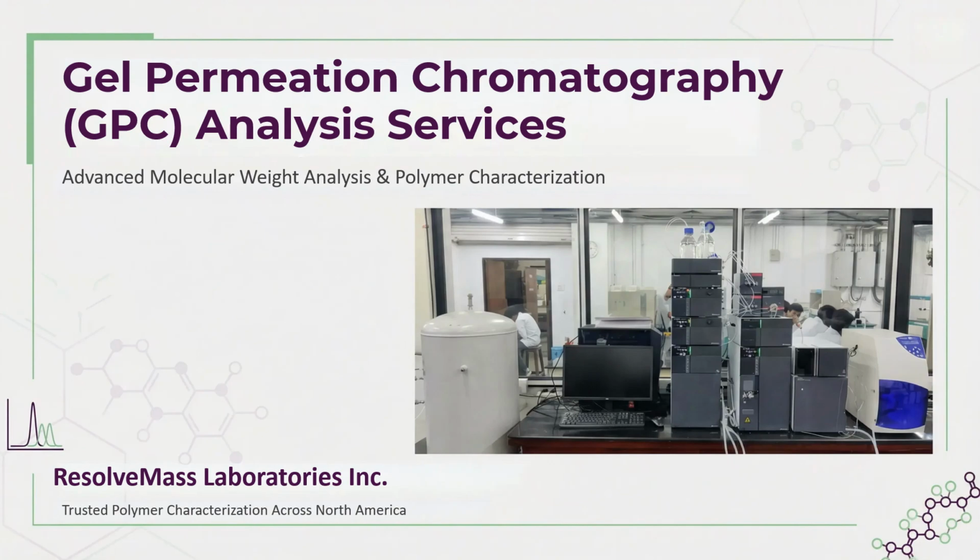Imagine you are developing a new polymer for a medical device or optimizing a coating for better durability. Everything looks perfect until performance testing fails. And the reason? Something as fundamental as molecular weight distribution. That's where Gel Permeation Chromatography, or GPC, becomes critical.